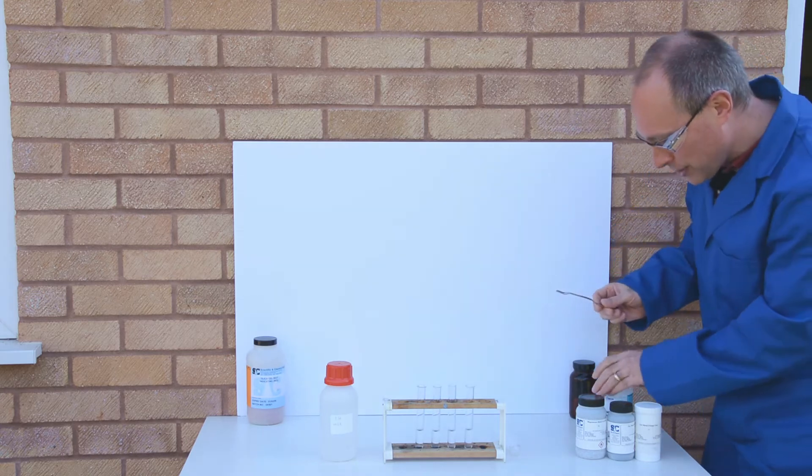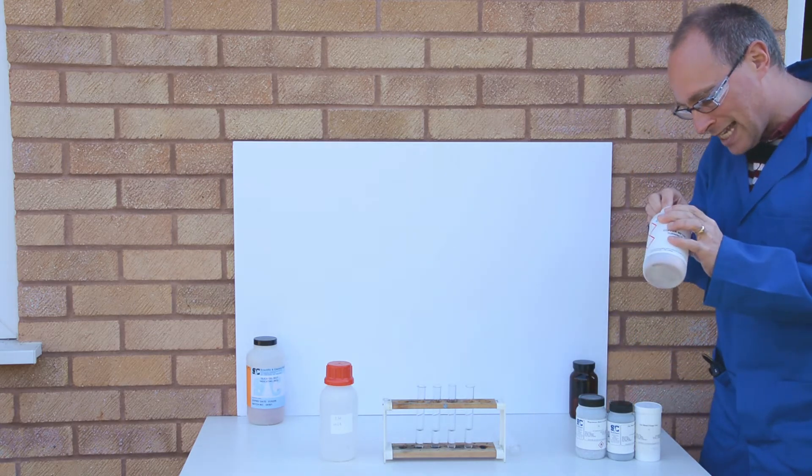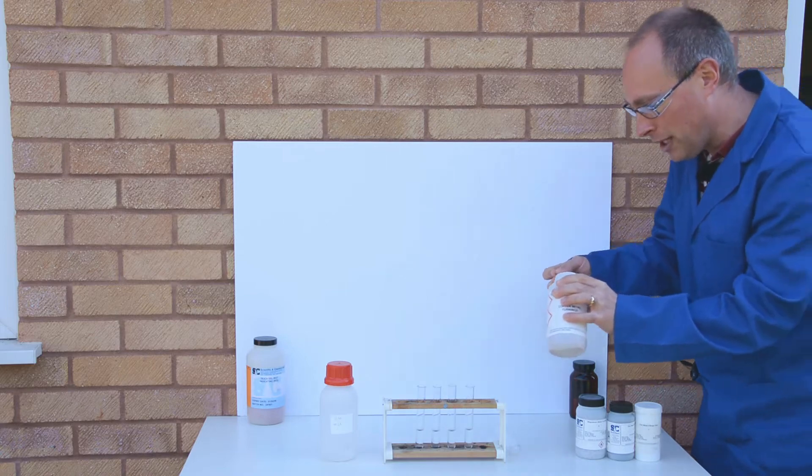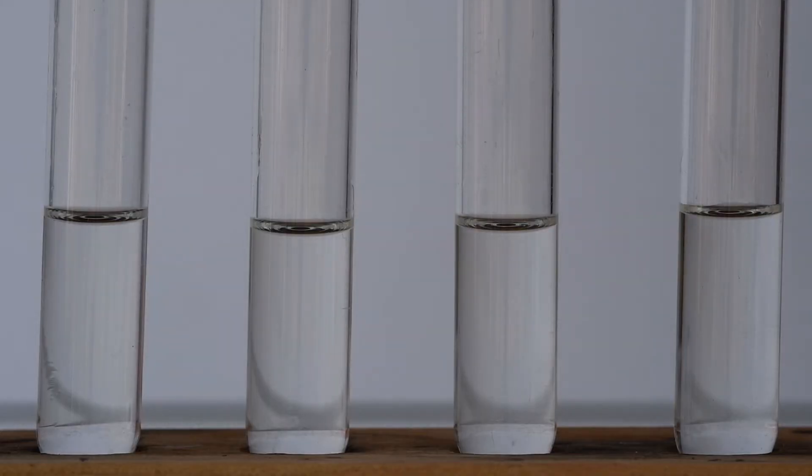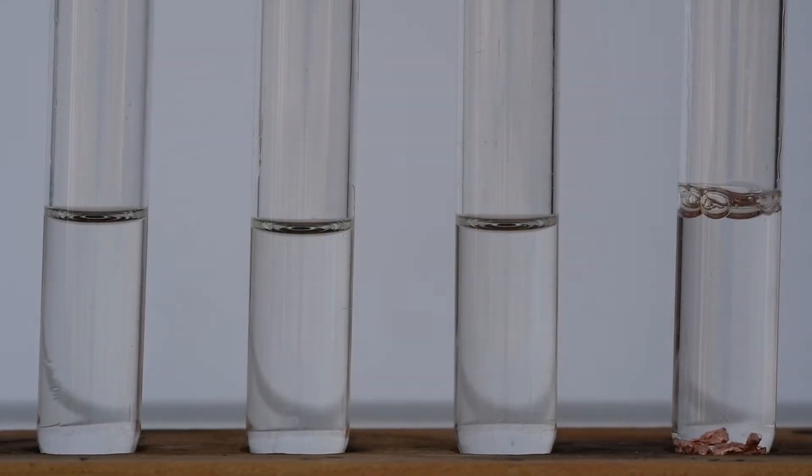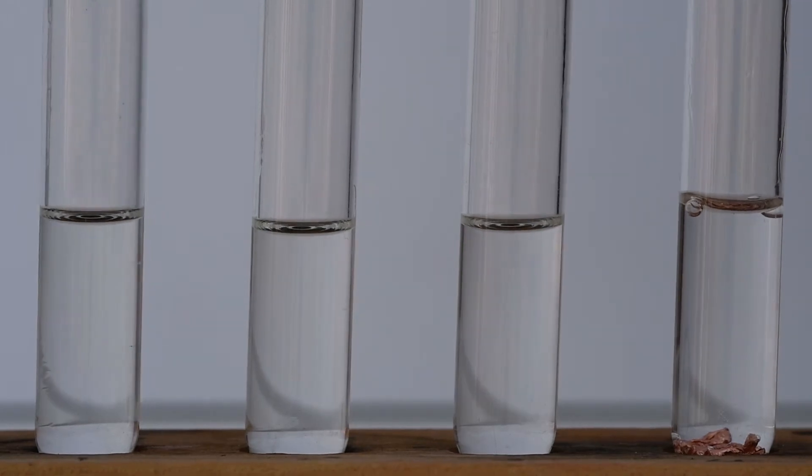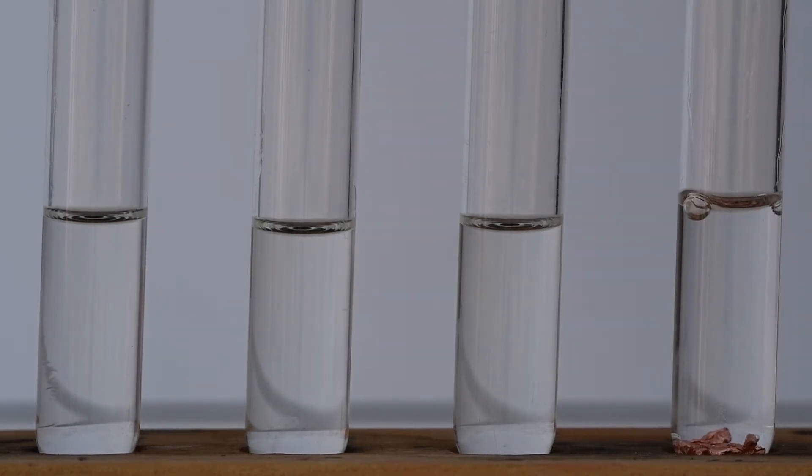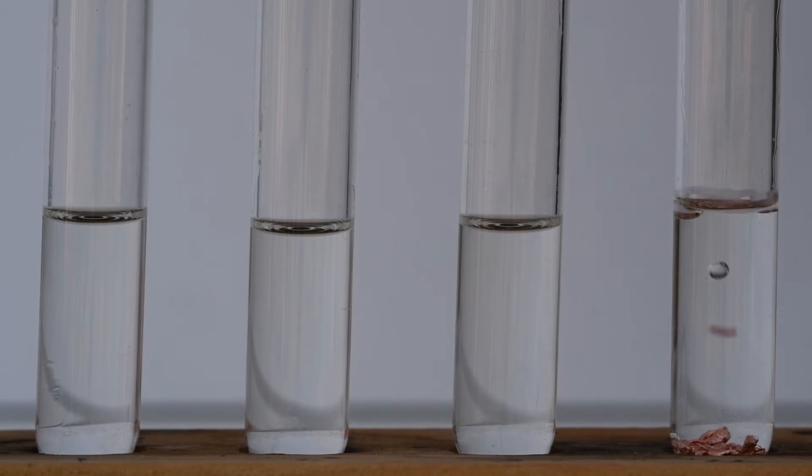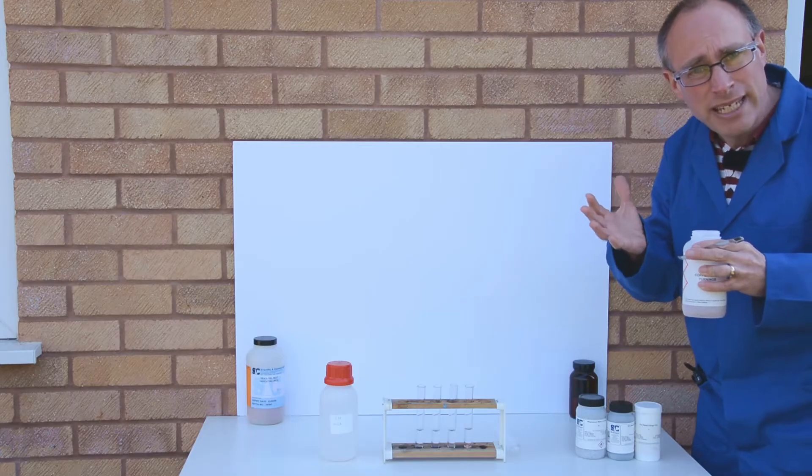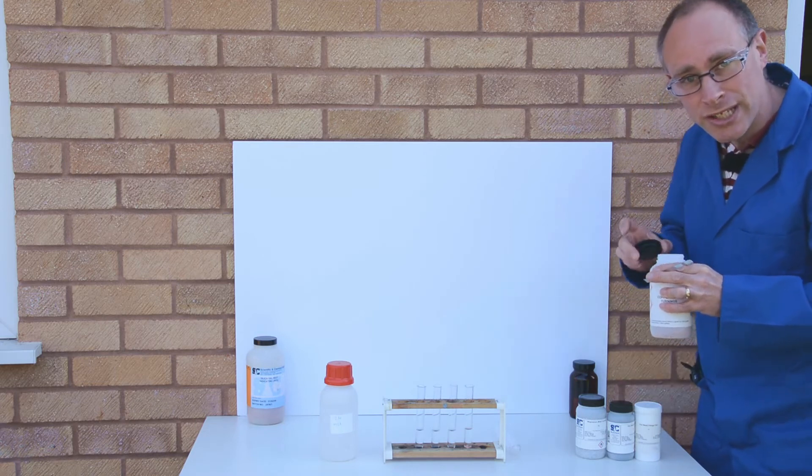So in the first test tube I'm going to add just a little bit of copper. So there's the copper and no evidence of any chemical reaction there. Any little bubbles in there are just due to little bits of air being trapped around those copper turnings.